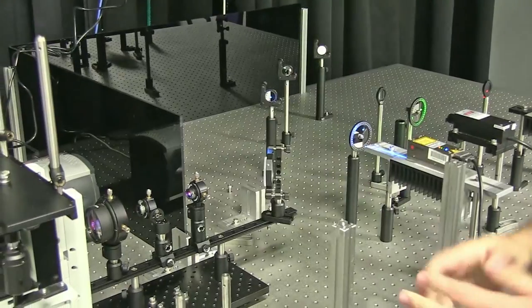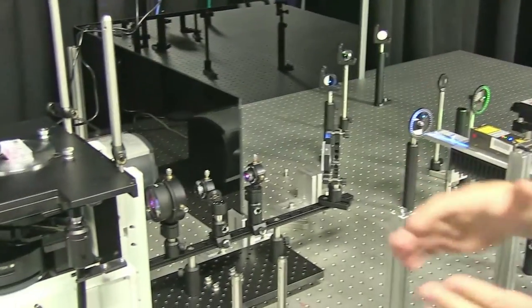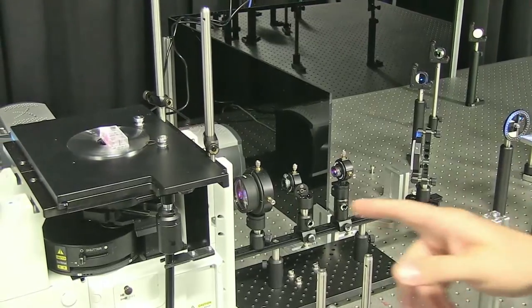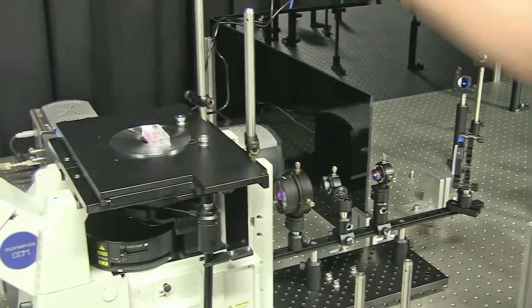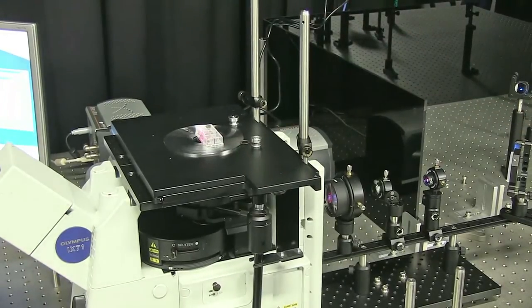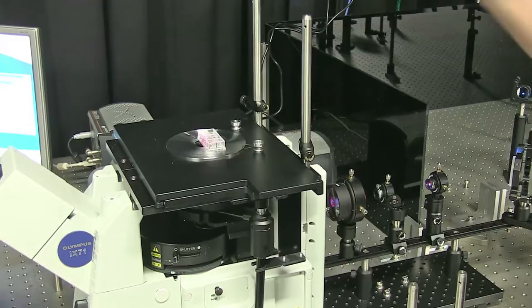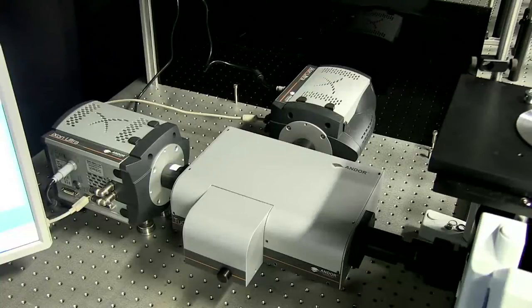These lenses here allow us to expand the beam and then focus it to the back focal plane of the objective. Light comes off another dichroic and into the sample which is mounted on top here. Fluorescence from the sample is collected back through the same objective and then steered around onto one or both of these EMCCD cameras here.